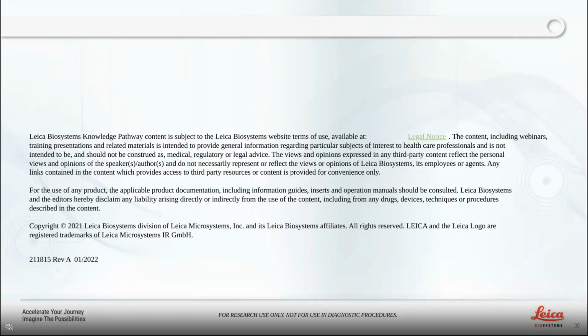Great, thank you. All right, next question here. Is storage at -80 also good or even bad? It is good. I think -80 storage will be perfect if you're trying to store the tissue for long term. That's what I used myself when I was storing tissue once I was done with my imaging, and I had no issues.